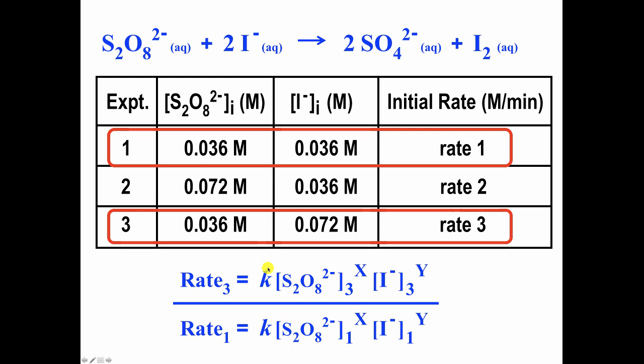And then what you would do is solve for k for your data from experiment 1 or trial 1, solve for k for trial 2, solve for k for trial 3, and then average your experimental results to get the overall k. And that's as much as we're going to do on this screencast for the calculations involved in the iodine clock reaction.